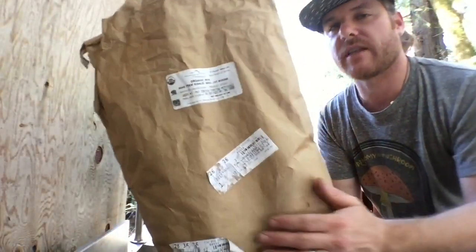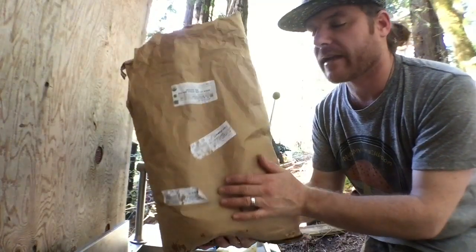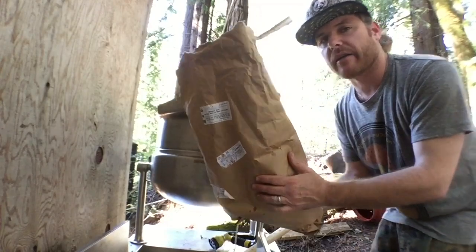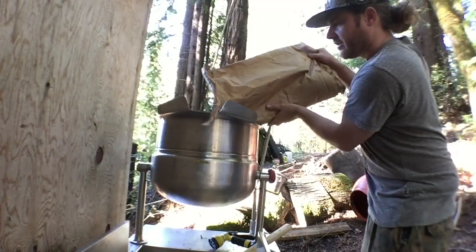So let's just pour this in. Usually we do about a whole bag, which is 25 pounds, and it comes out to about 40 pounds of spawn, wet, after you autoclave it. So we're just going to dump it in here.